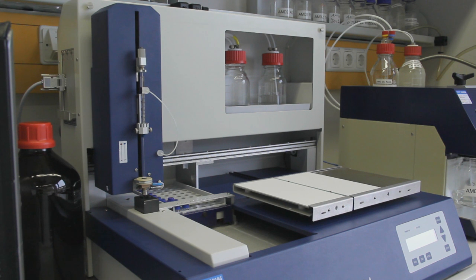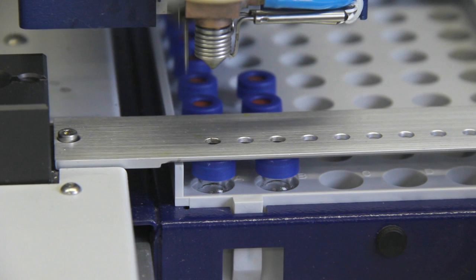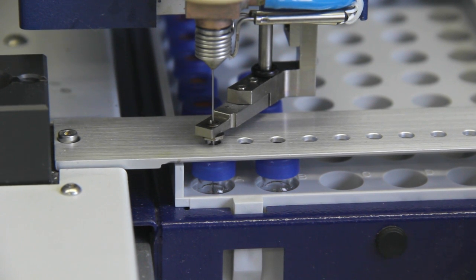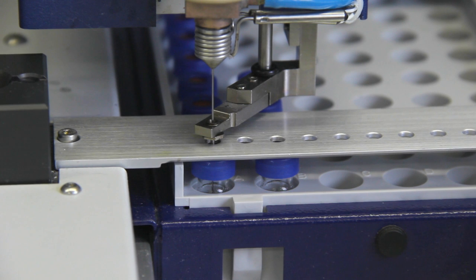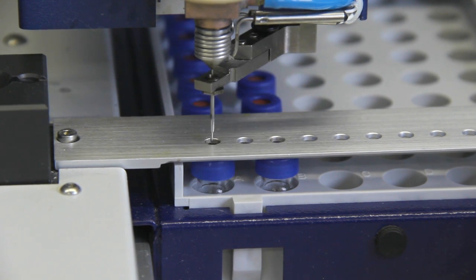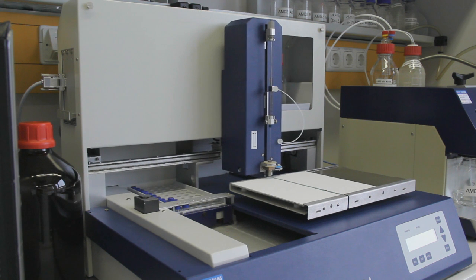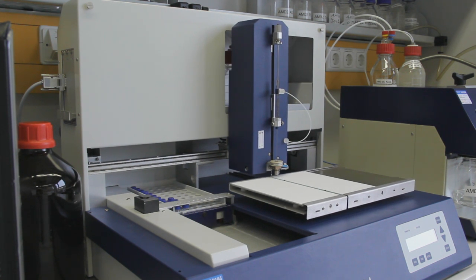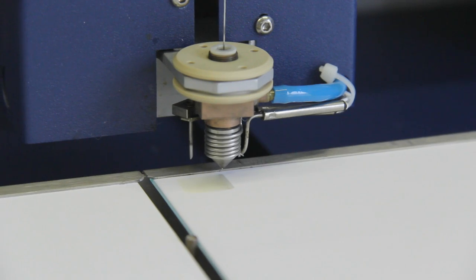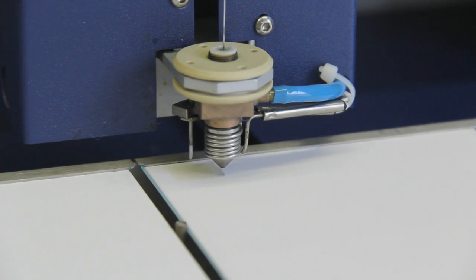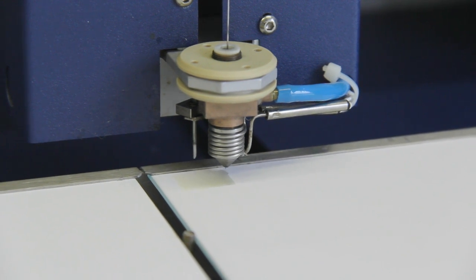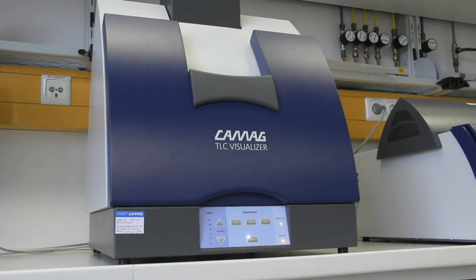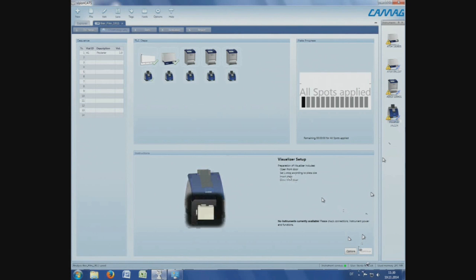After rinsing the ATS-4 syringe, 300 µL of each beer solution were withdrawn and sprayed on the plate as aerosol by nebulizing with nitrogen gas. Each sample solution was applied in the form of a rectangle of 10 x 30 mm to spread the huge beer matrix over a large adsorbent area. The dosage speed was 800 nL per second. Now the samples were applied.